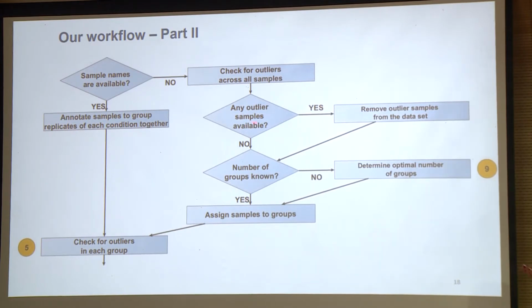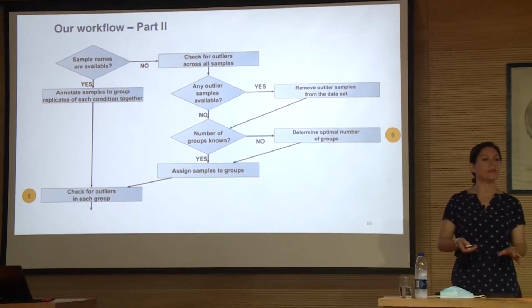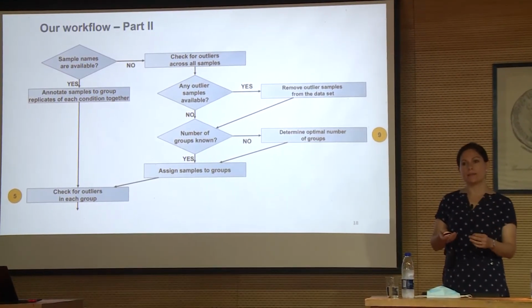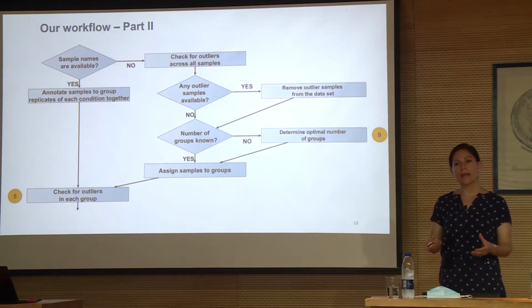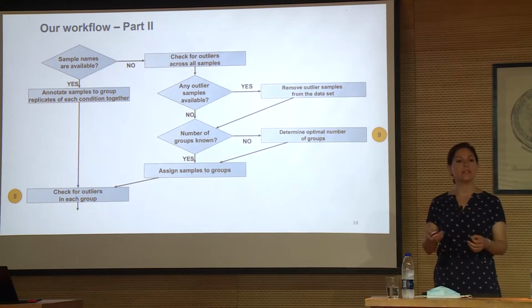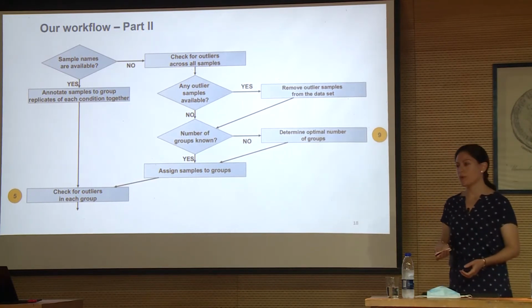But then the question would be, do you know at least what it's about? How many treatments are there? Do you know that or still don't know that? This is the minimal information that you can add. It will always help if you tell the workflow these details, but still, if you don't know, the workflow can operate without them.